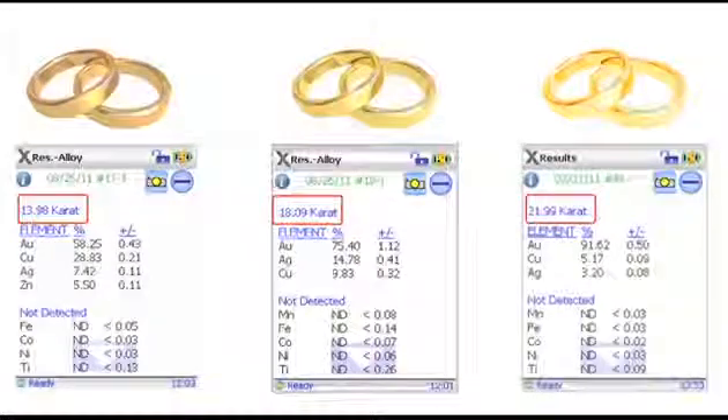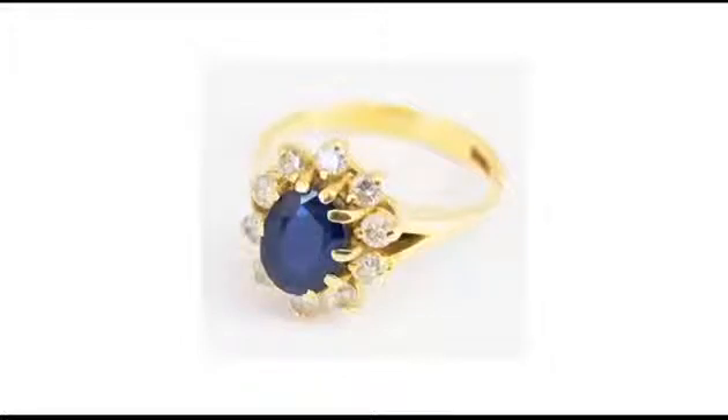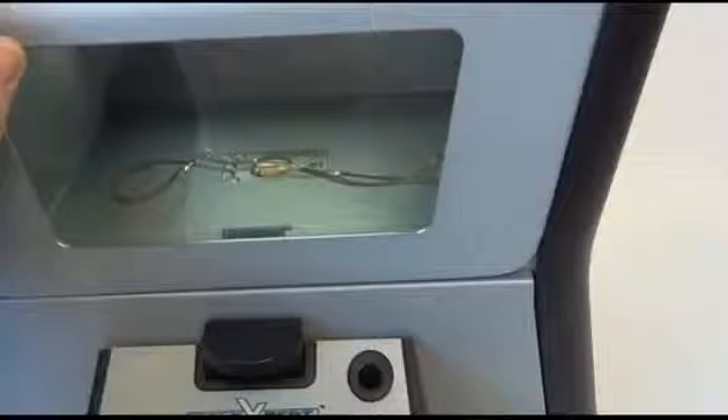Gold Expert testing is completely non-destructive. The sample is not affected or harmed in any way. The Gold Expert's viewing window and well-lit chamber allows both operator and customer to see the sample as it is being analyzed.